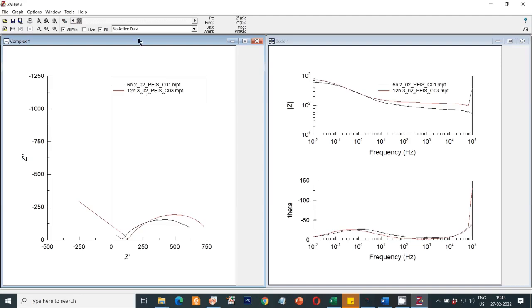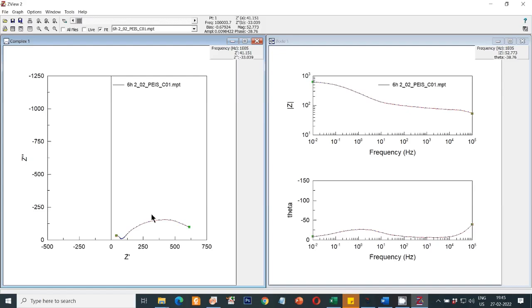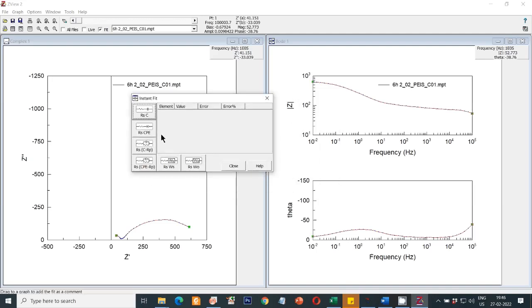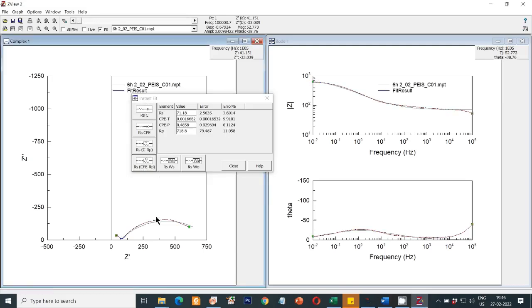Let's analyze this black line, which is the six-hour slot. I have to select it first. You can see there are two capacitive loops in this Nyquist plot. Coming to the instant fitting option — click on instant fitting and this box will appear with a very simple equivalent circuit. Selecting this option gives a fitting graph, but the fitting is not perfect because it is fitting only around the second capacitive loop; the first loop is not being fitted.